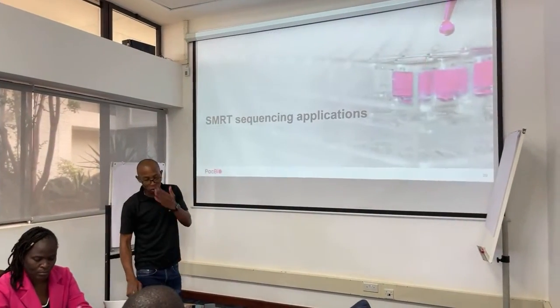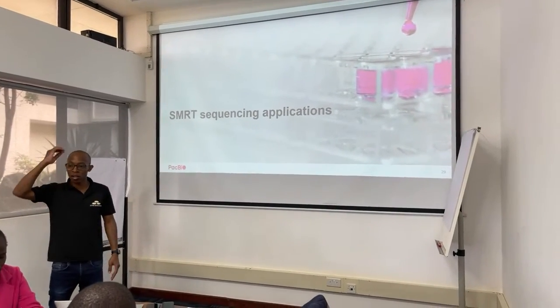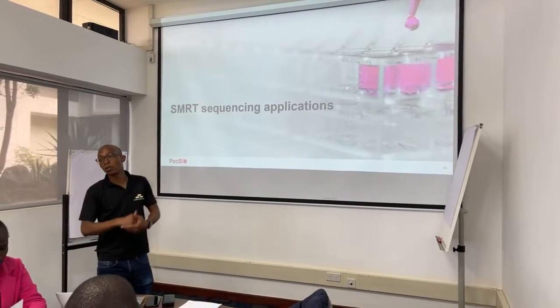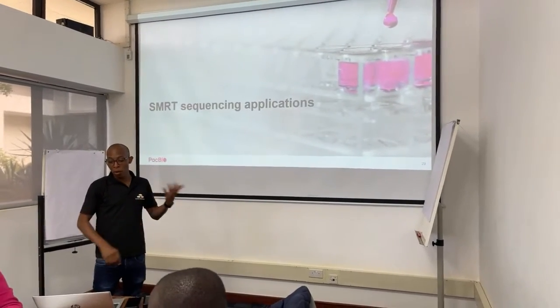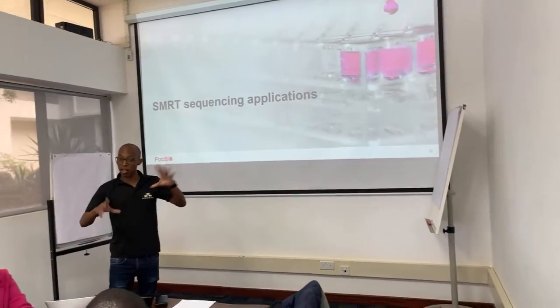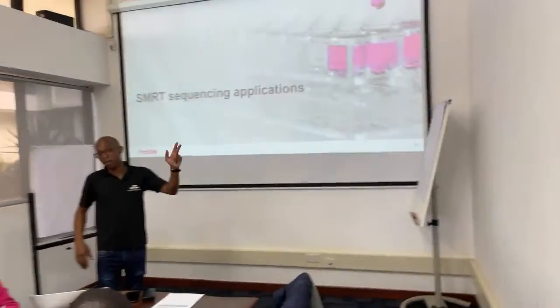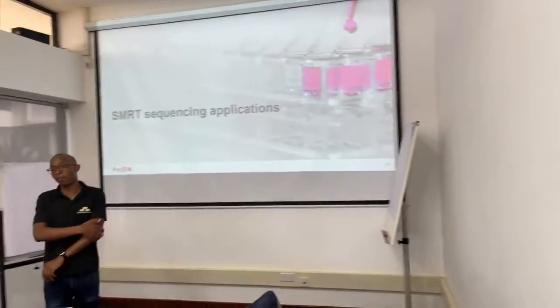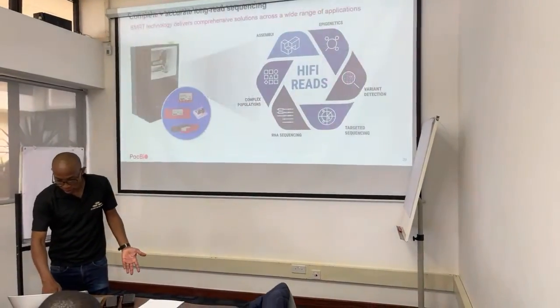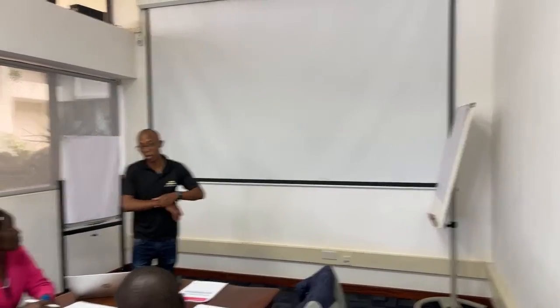And then the data analysis we will do once the run is done. I'm sure someone will register with your names. Once we've run that genome, our bioinformaticists will set up a meeting with you so that you can go through the assemblies, methylations, everything, with you remotely. And then I think that's it. You have to go to the lab. For me, the worrying part is the extraction, and hopefully it goes well. But I think we have plenty of sample if it doesn't.